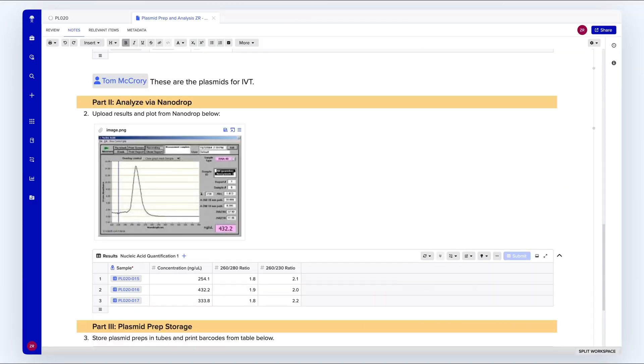I can also standardize experimental data capture with results tables and integration with instruments. These tables ensure data is entered consistently across users and help streamline data analysis later.